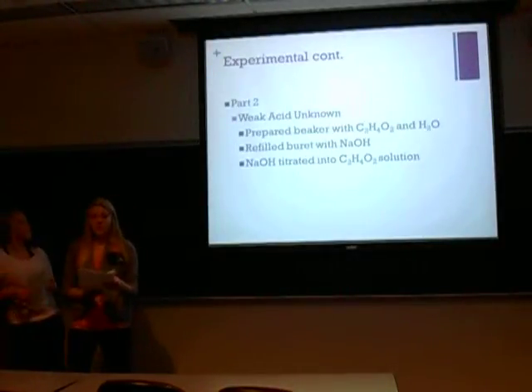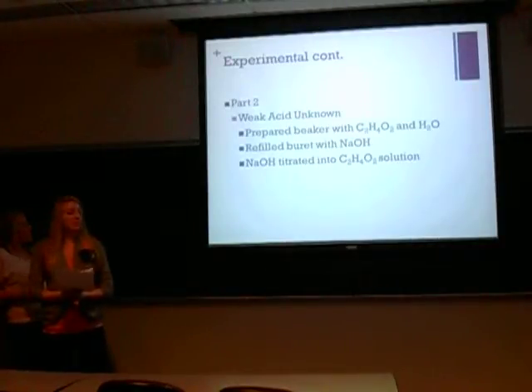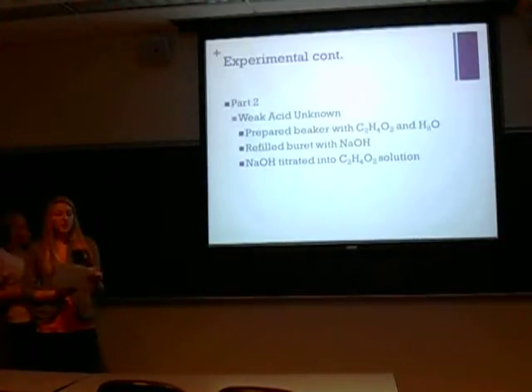Using the weak acid obtained from our instructor, titration methods similar to those of part 1 were used to determine the equivalence point of our unknown weak acid.